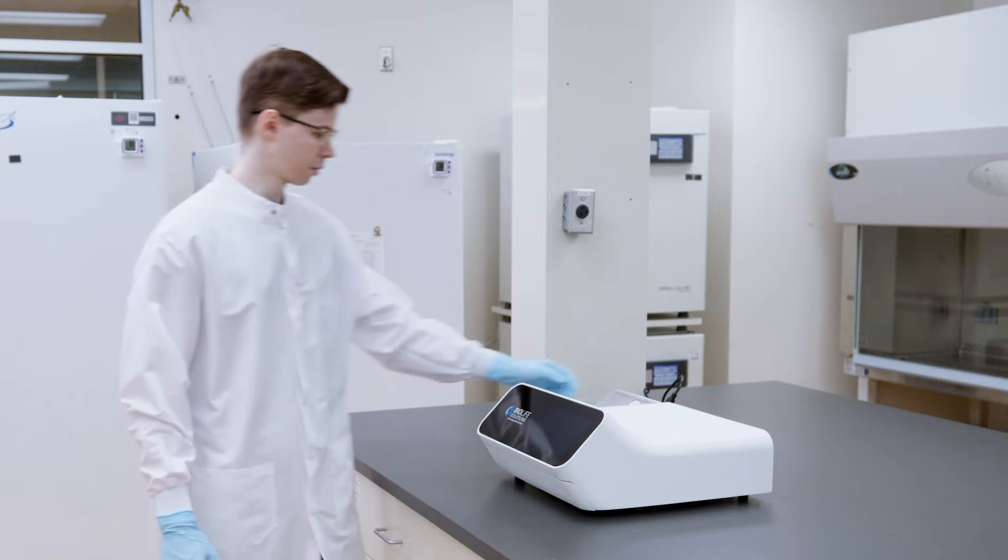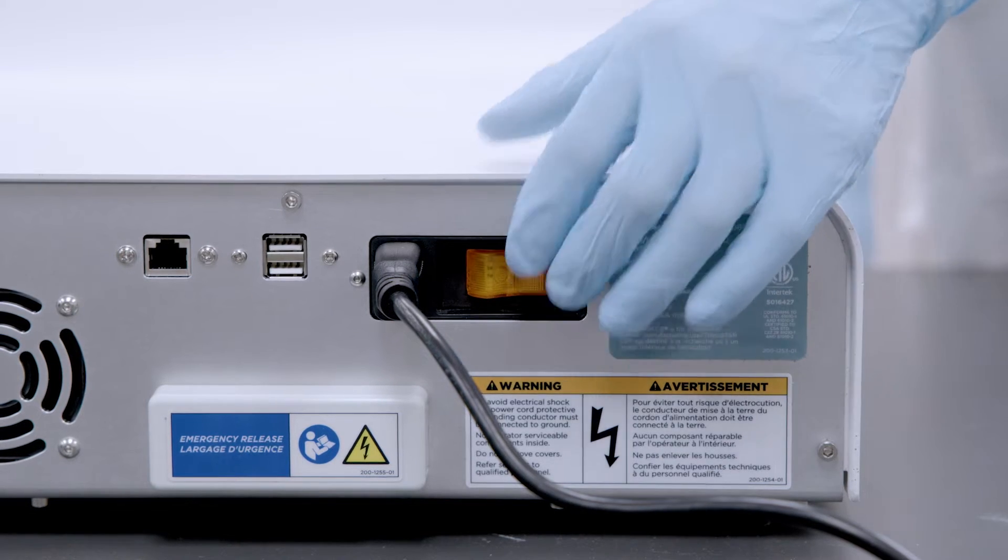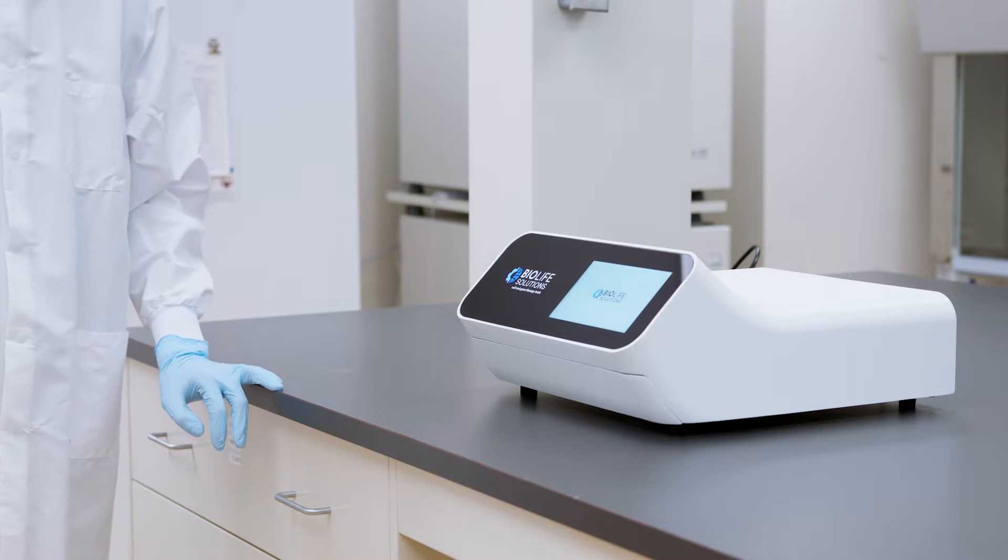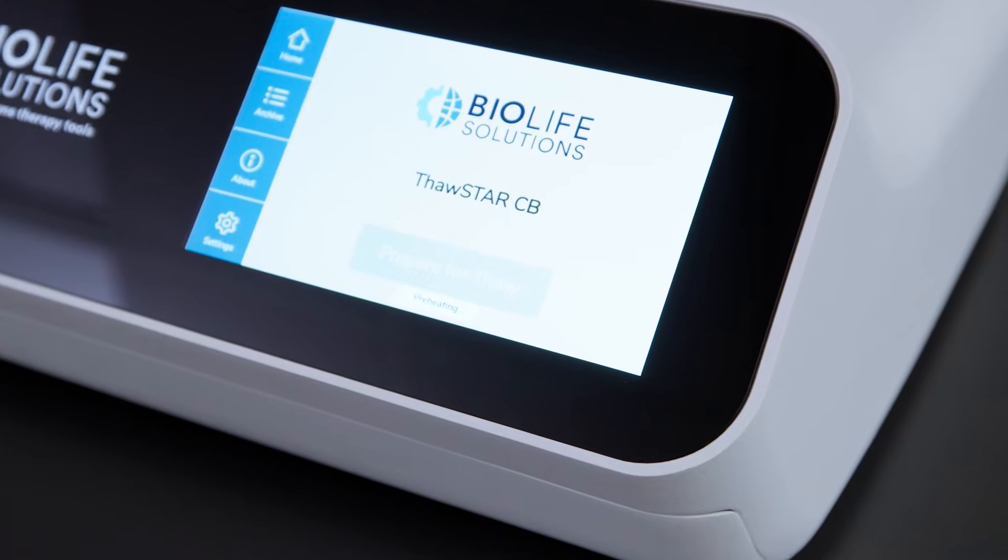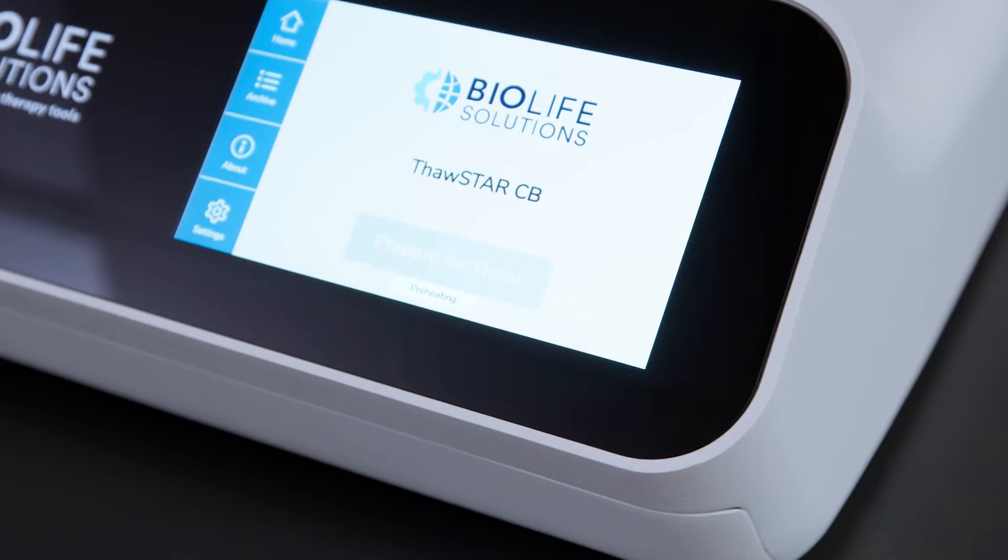To start, turn on the Thawstar CB and wait until it completes the preheating sequence. The system will be inoperable during preheating. An on-screen indicator will notify you that preheating is in progress.